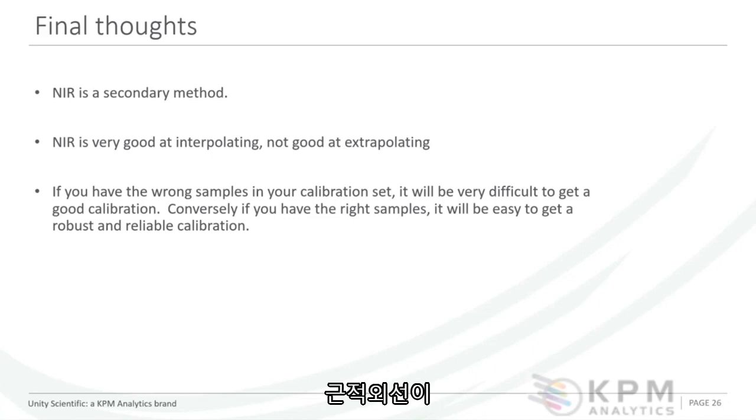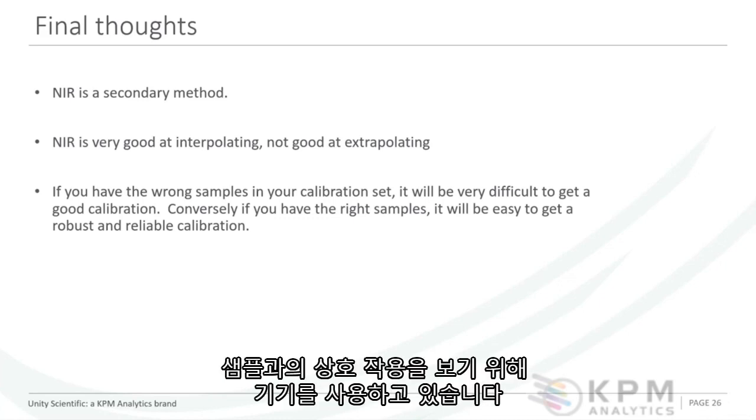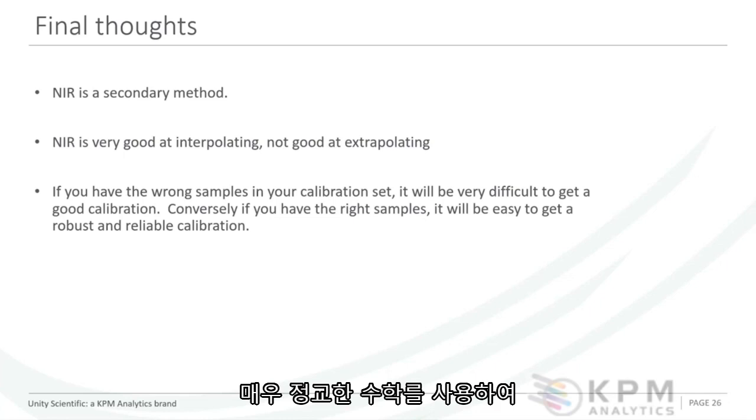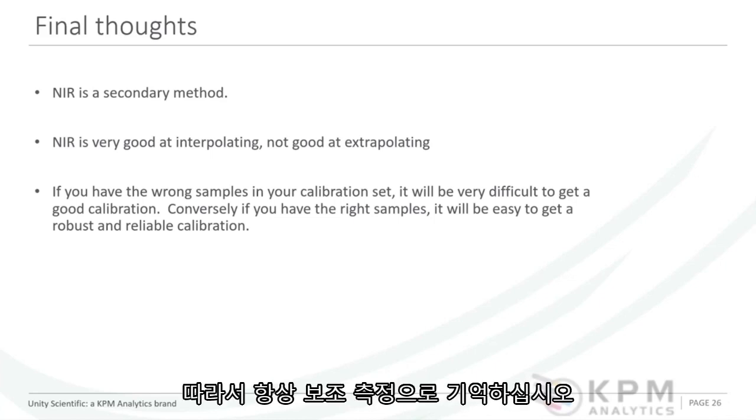So we are using the instruments to look at the interaction that near infrared light has with our samples. That interaction is based on bonds. Those bonds are found in our molecules of interest. And we are using good analytical techniques and very sophisticated math to make that relationship. So always remember it's a secondary measurement.